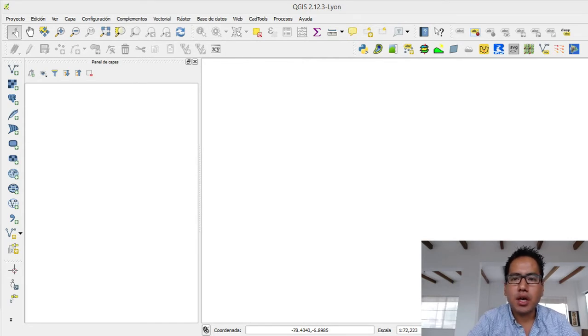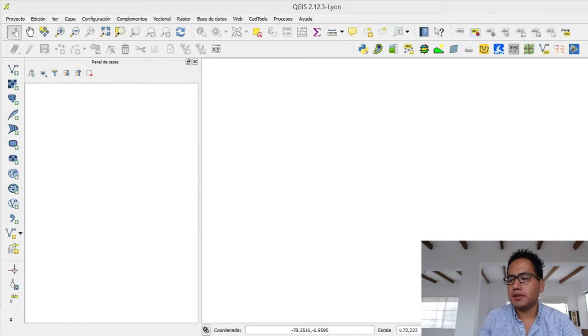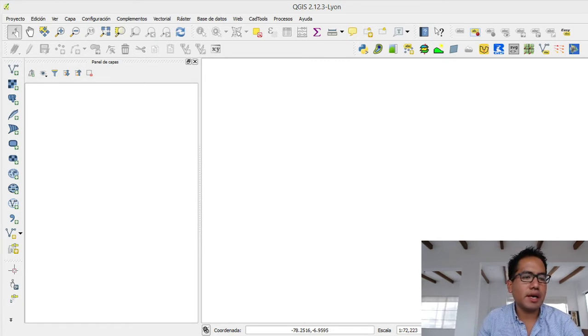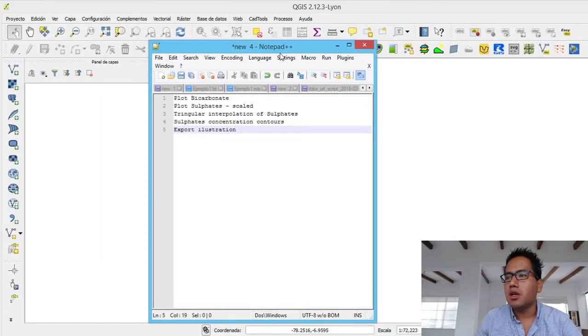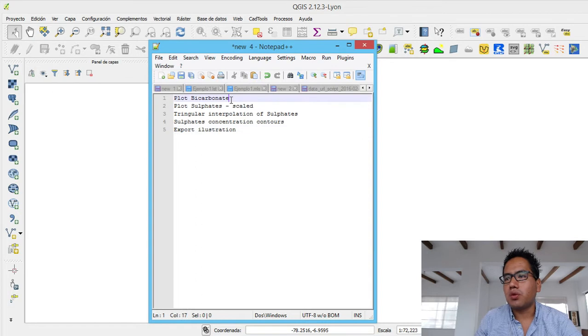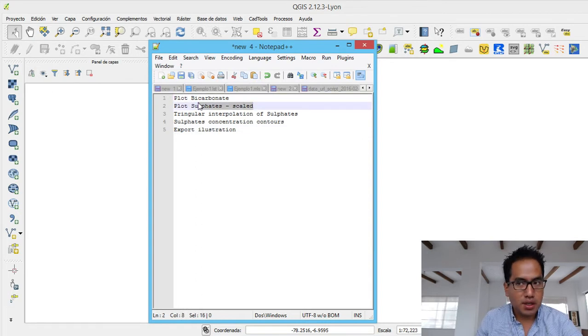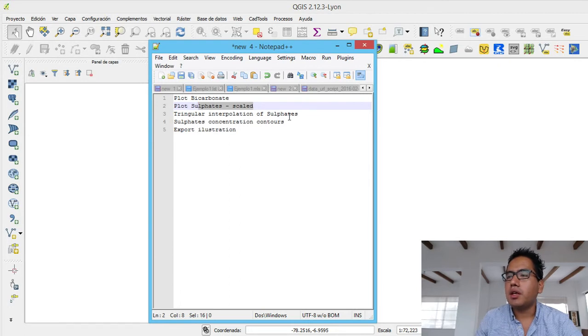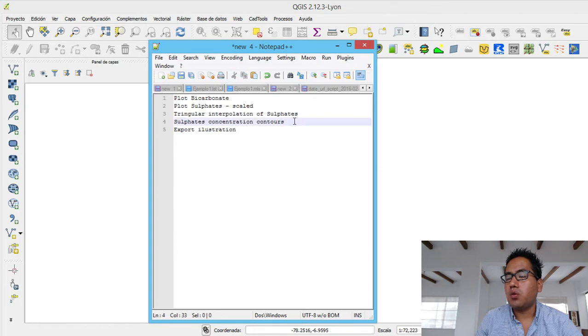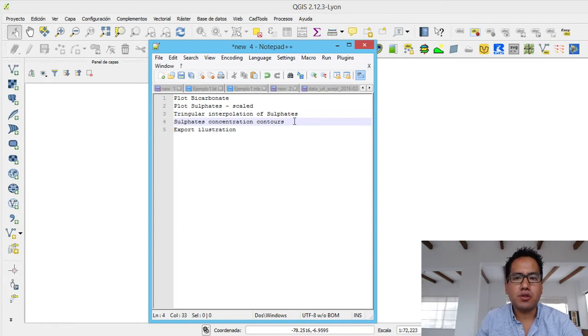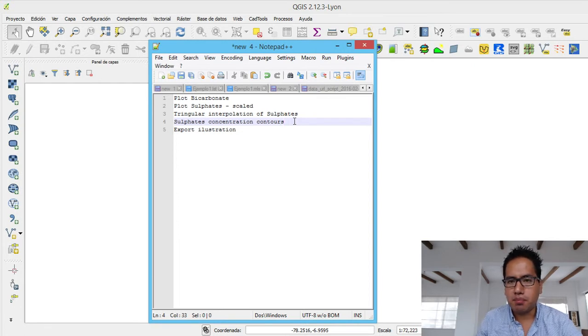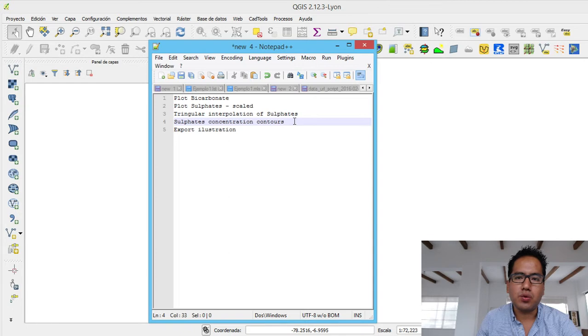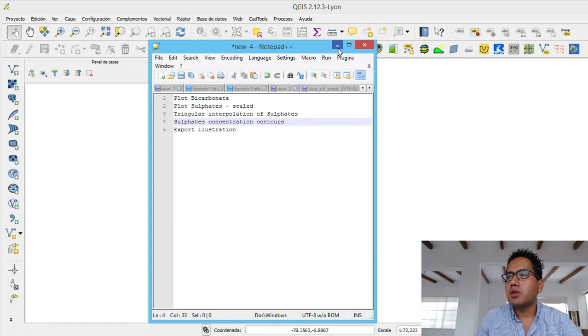So we have a set of data and we want to represent it, analyze it, plot it, or generate some maps. Here we have the four tasks that we are going to do. We are going to plot bicarbonates, plot sulphates from the data, do a triangular interpolation of sulphates with concentration contours, and then export an illustration. The illustration is a quick map feature of QGIS that is very helpful if you want to do a report or PowerPoint presentation. So let's begin.